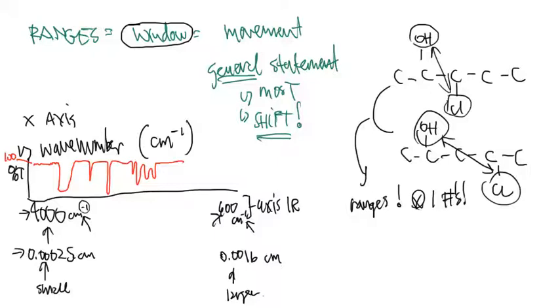And wave number is basically 1 divided by the centimeters. Centimeters is used because nanometer is too big. Remember, we're looking at 100,000 here or lower. Some people don't like to write that many zeros, so they take the nanometer and convert it to a centimeter. And then some people still don't like that number.